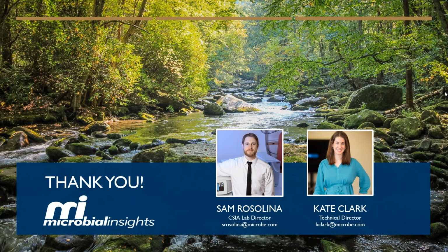So, Sam, one of the questions that we have is specifically for you. It's talking about CSIA, and it says, does the delta value increase with abiotic degradation too? So I think it might be good if you can talk a little bit about how we can differentiate biotic from abiotic degradation.